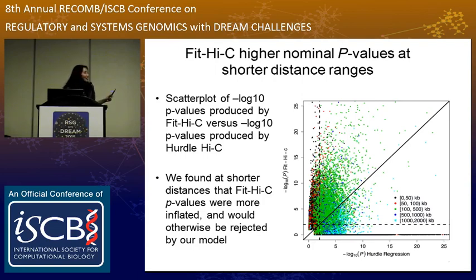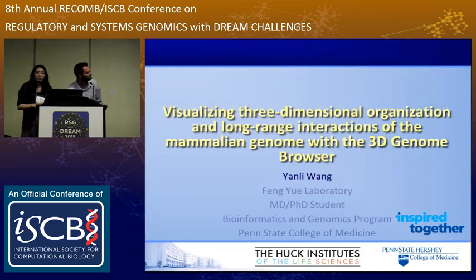But one question is, you said context three times in a row, really fast. I don't know how you said that. But it strikes me that in your display, you do this triangle in your Hi-C context, which leaves half of your display white, and you're losing all that space that you could use. I know that the triangle shows the contacts that involve the locus shown below.